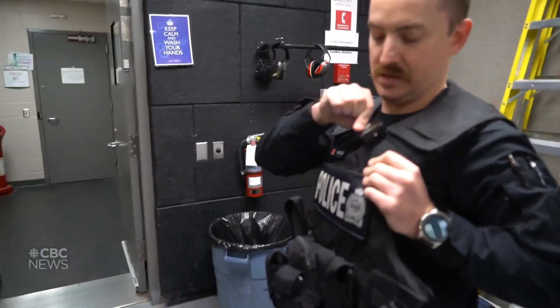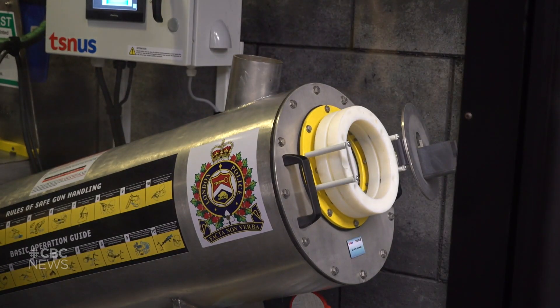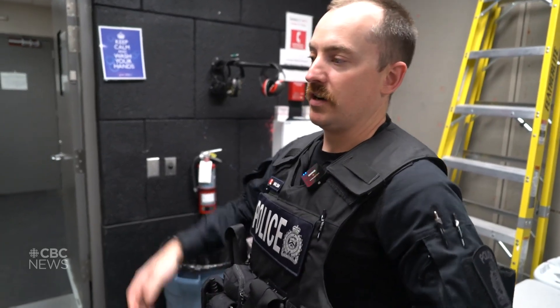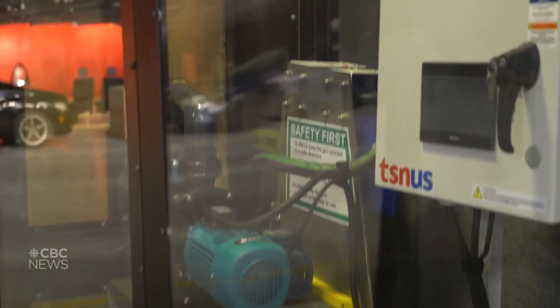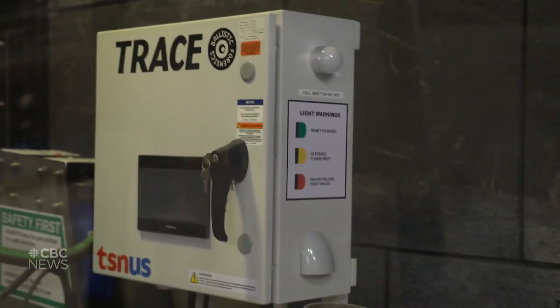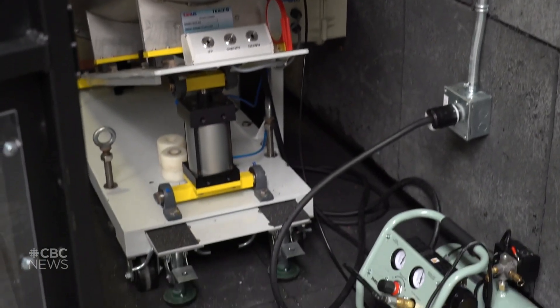This is our new ballistics chamber. What this allows us to do is generate our own firearm ballistic samples in-house. The purpose of this tank is to connect shooting incidents in the city and upload those samples to the IBIS database, which can make linkages between firearms across North America.